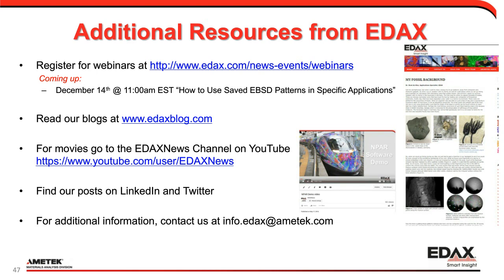But in this case, if you don't have the EDS data, you do have things like the IQ map. IQ map can be useful. I've seen it done before with things like martensite-ferrite issues. There EDS doesn't make that big of a difference, but the IQ map does. The IQs are just way different between what you're looking at.